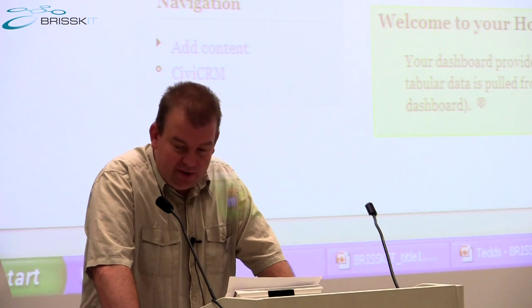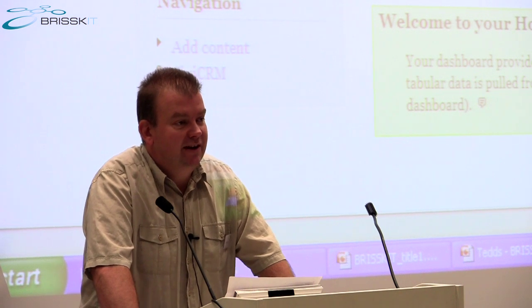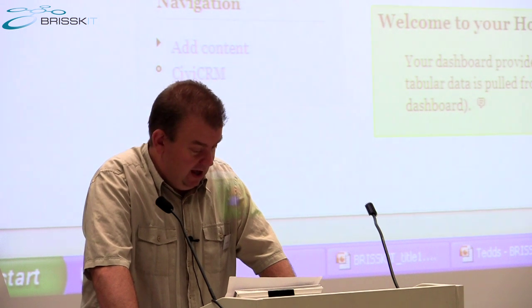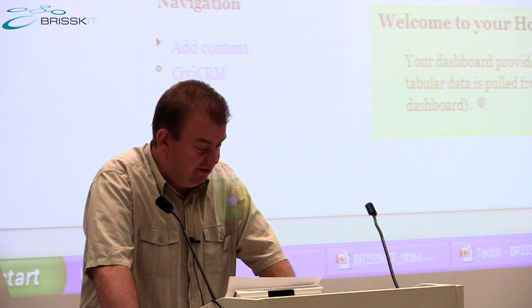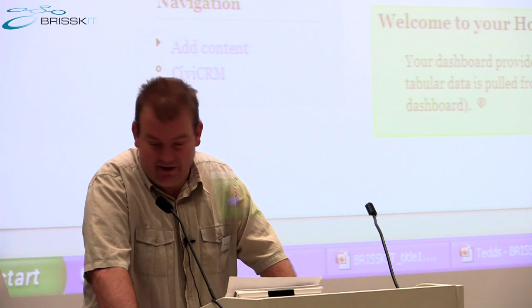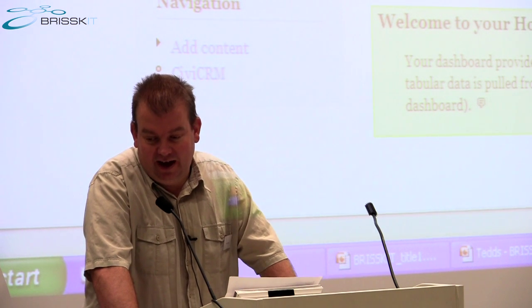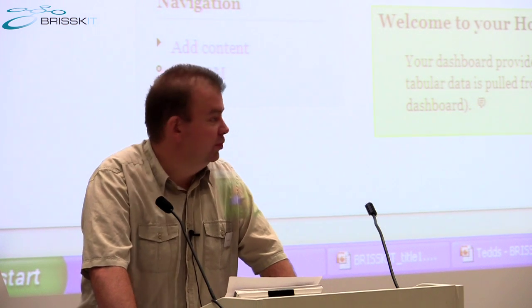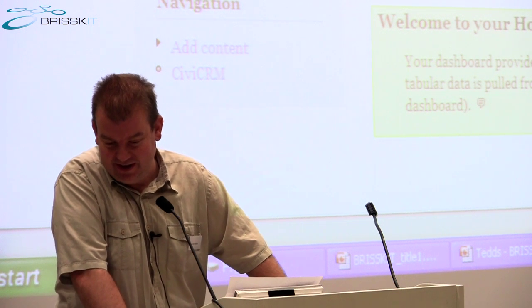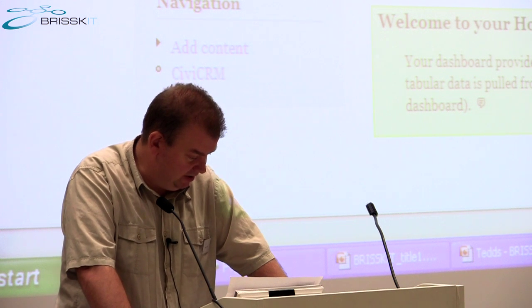So what I want you to imagine is that a patient has been consented and recruited out in a GP practice for involvement into the study, and that blood has travelled from the practice to the research centre, and that's what we'll hopefully be illustrating. So the first of the applications that our research team will use would be CiviCRM, and Ollie's helpfully already logged in to a BRISSKit instance of CiviCRM to illustrate what the research staff will be doing.